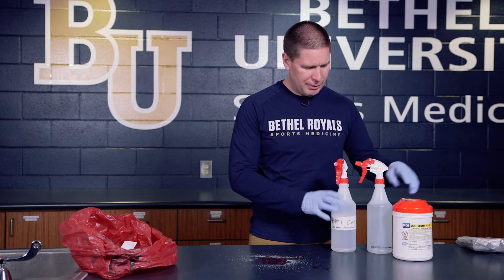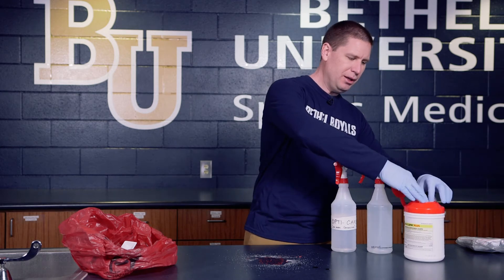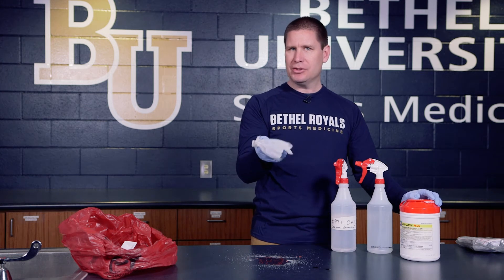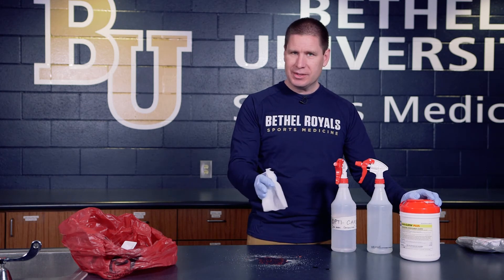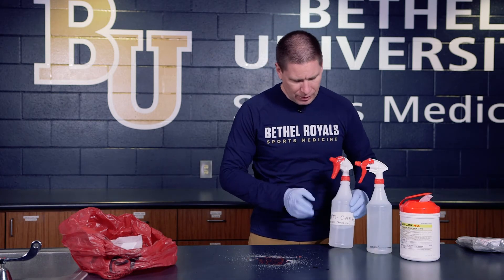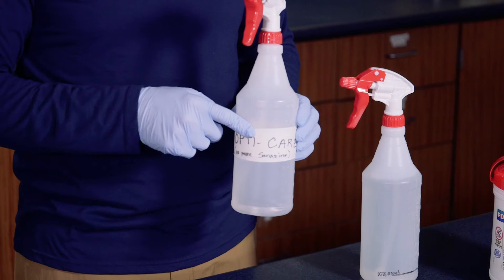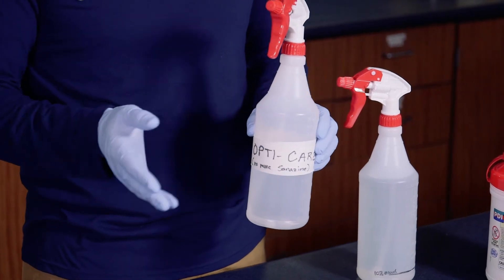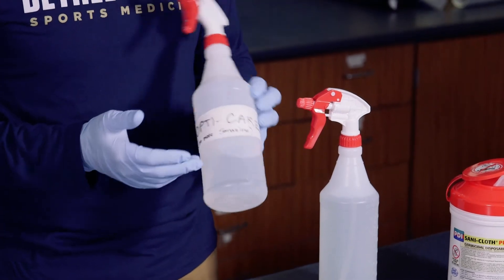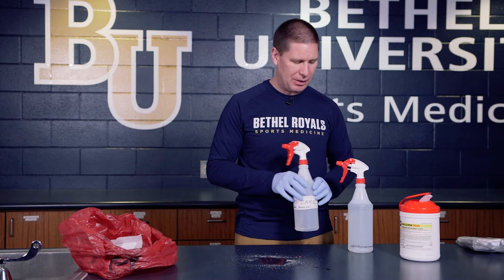I'm demonstrating a number of different products you can use. You've got a pre-mixed hand wipe that has germicidal solution in it — you could use this to wipe up as well. I also have two types of spray mixes. This one is a solution that disinfects and kills any type of blood-borne pathogen and is also safe for fabrics — it's called OptiCare. We used to use Sanazine, but there are all kinds of different commercial products available.